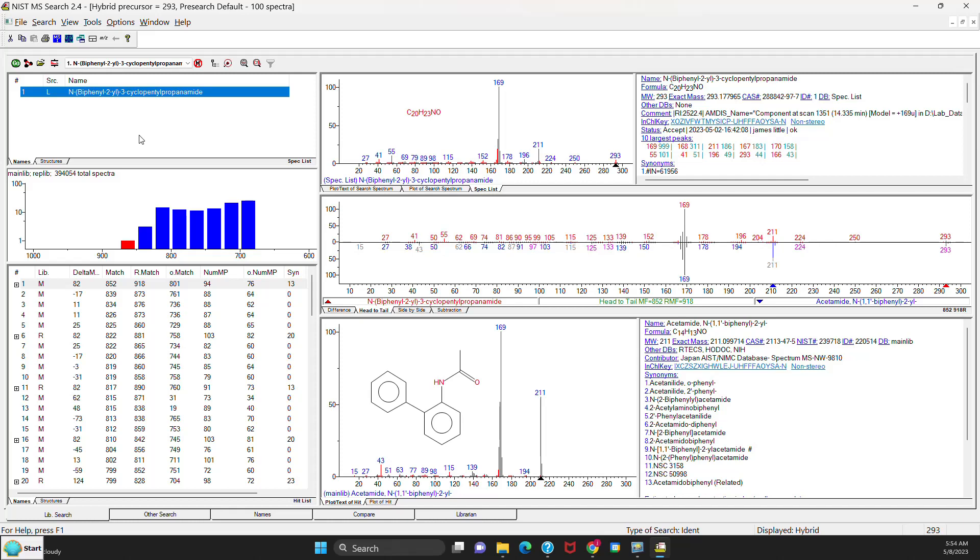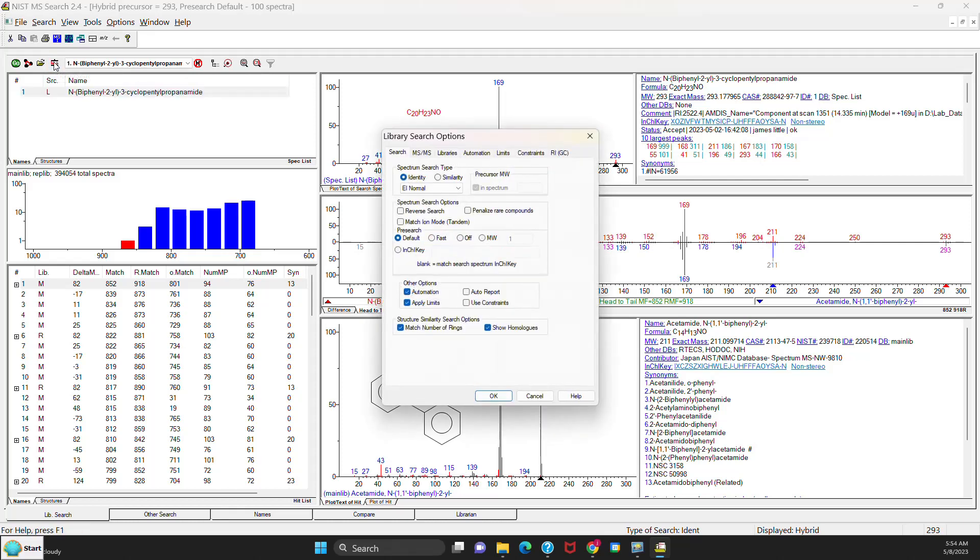Before I show you the changes in version 3, I want to review the software as it appeared in version 2.4. So one of the biggest changes you will see if you go to the Library Search Options menu and pull down the Types of Identity searches, you'll see that all of the searches are there, including the EI and the MS-MS.